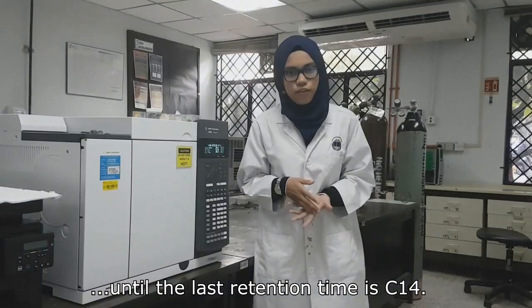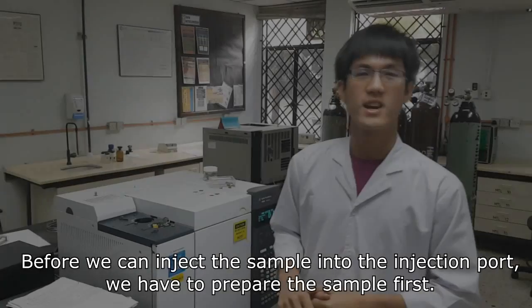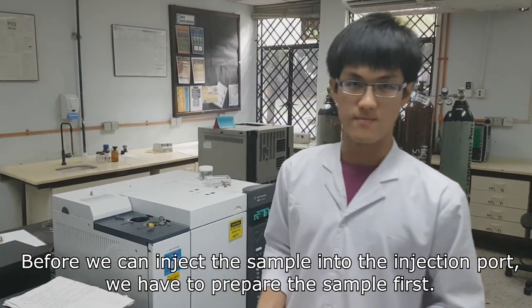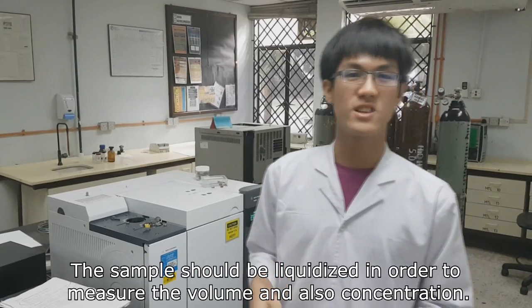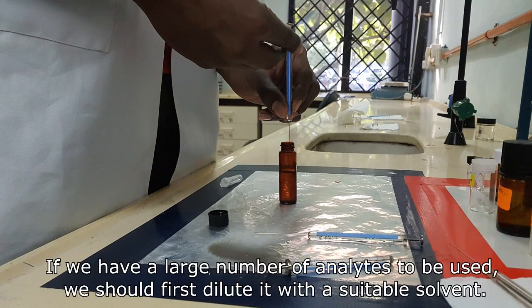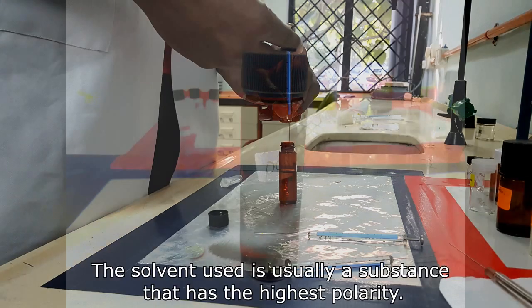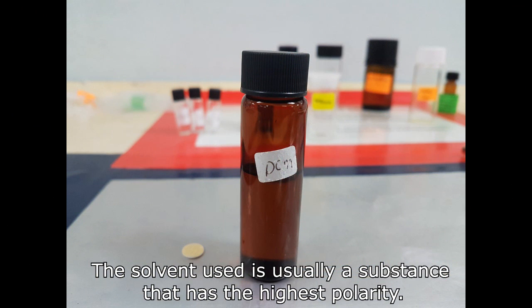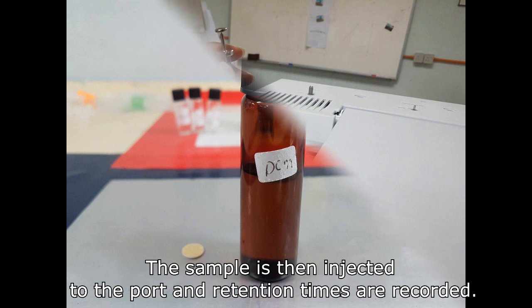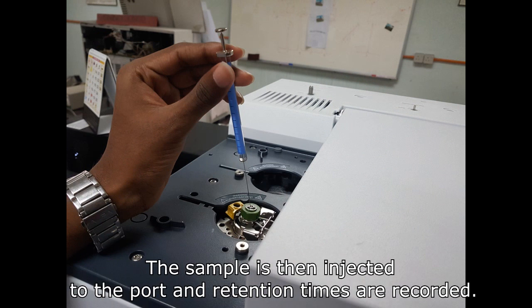until the last retention time is C14. Before we can inject the sample into the injection port, we have to prepare the sample first. The sample should be liquidized in order to measure the volume and also concentration. If we have a large number of analytes, we should first dilute it with a stable solvent. The solvent used is usually a substance that has the highest polarity. The sample is then injected into the port and the retention times are recorded.